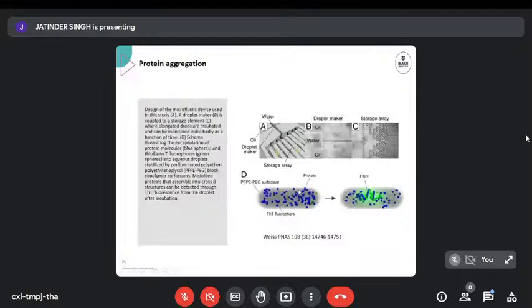So proteins were present, some level of surfactant and a fluorophore to measure what was going on. Droplets in those trains, in those lines sitting here, all had slightly different conditions. And in these droplets, you could individually study the aggregation of the proteins because the fluorophore here only became activated once we got these fibrils, these clumps of protein coming together, being formed. So by looking at the fluorescence intensity of these parked droplets, how that changed, we could get an idea of the protein aggregation and if these droplets were actually any good condition-wise for protein aggregation or not.